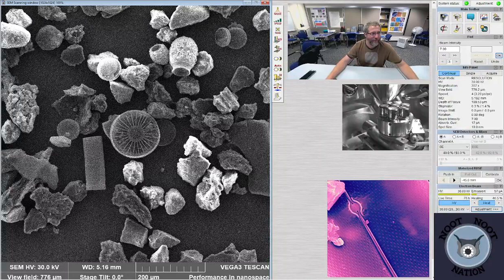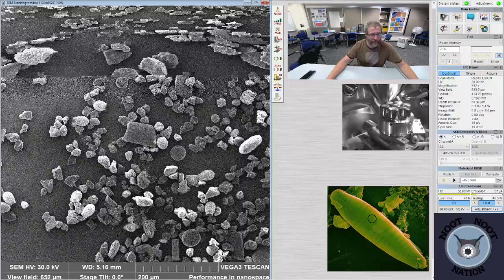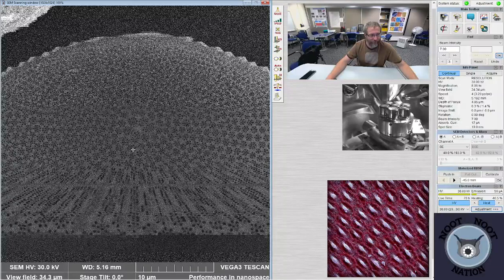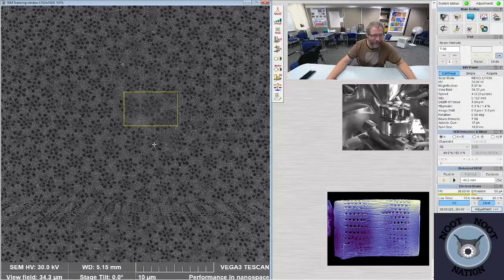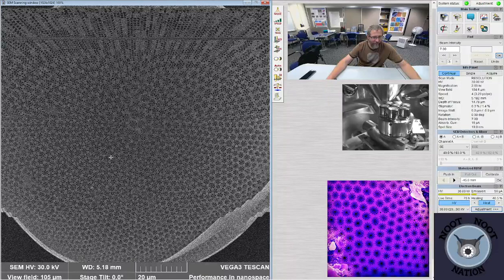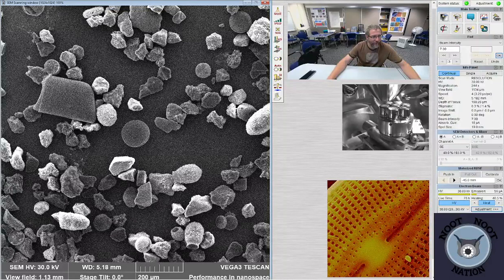Right now we're looking at some material that Pacific Plankton sent me, and not surprisingly, it's from the Pacific and it's plankton. These monster diatoms are filled with holes as usual. That one's kind of cool. You can see all the little tiny circles are filled with a bunch of other little circles. And we're just kind of rolling around in the sample looking for fun stuff.